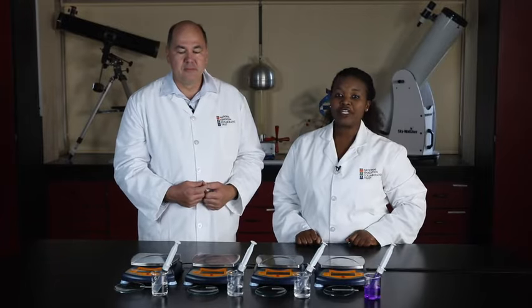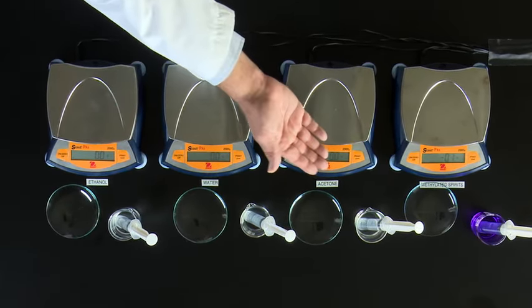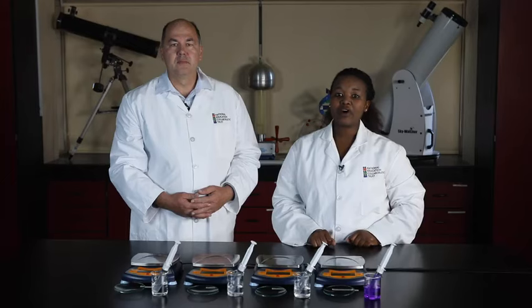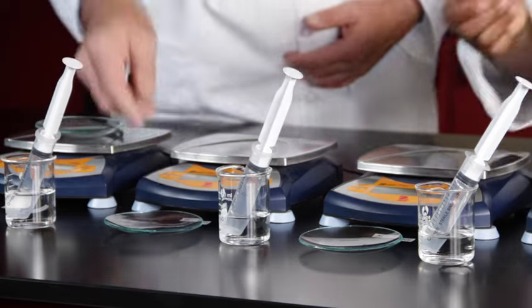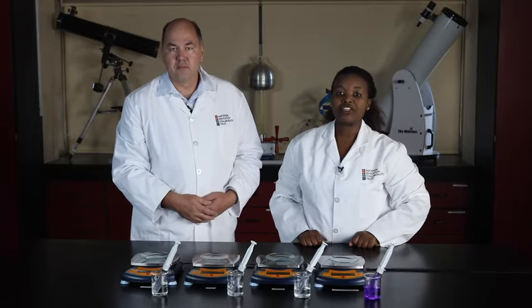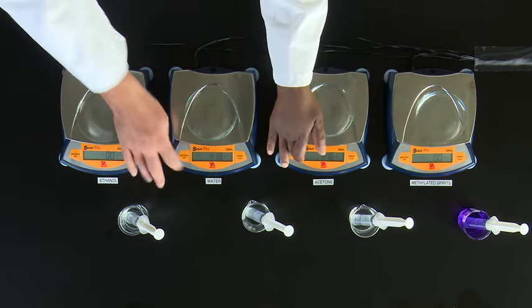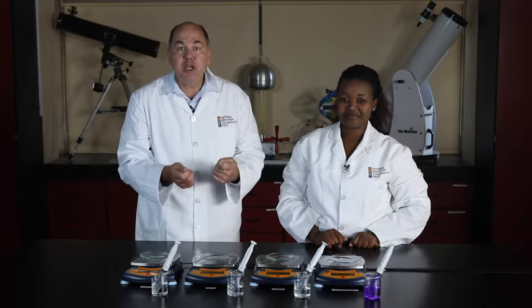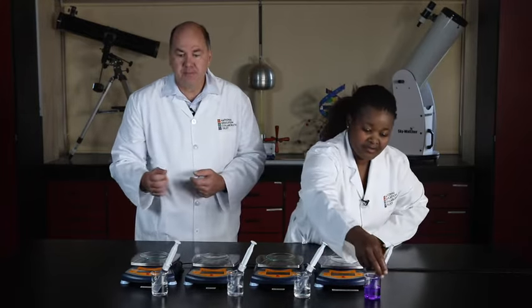We'll use 4 different liquids: ethanol, water, acetone, which is the main ingredient of nail polish remover, and methylated spirit. We place 4 watch glasses on electronic mass meters. Then we zero the scale so that we can measure the mass of the liquids when we add it to the dish. Now we add 20 ml of each liquid to each dish and record the mass of 20 ml of each liquid.